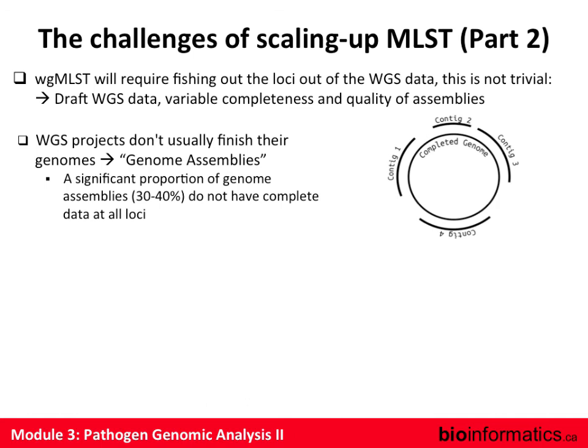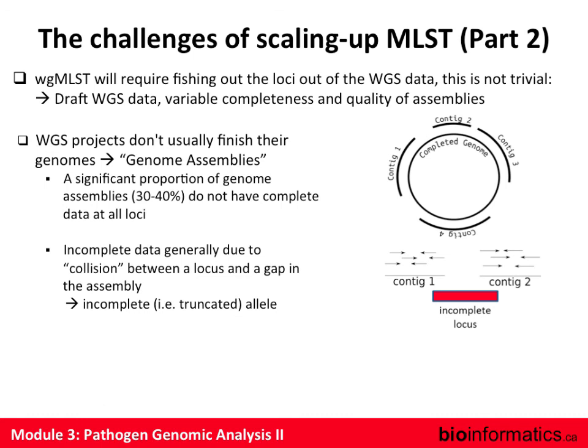When you have two contigs and a gap in between, if there's a gene right there, you can't decide what it is. You can't tell. A good assembly might have 50 contigs. I don't know, what's a good assembly for you guys? 30? 50 contigs? Okay. Best case scenario, one single contig, right? But most of the time, if we can reduce it down to maybe 50 contigs, that's a bunch of gaps, with genes that we can't assign.